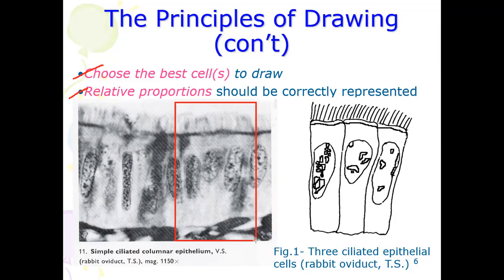Now, in the nucleus, you can see nucleolus as well as the heterochromatin. So therefore, you need to draw them. You actually need to draw them because you've learned those structures. So can you see that inside the nucleus is not empty? There's something there, but there's no shading because you cannot shade. Cannot shade means you cannot put the dot also because you use dot for shading purpose. You can see a dot here, but you cannot dot there. You can only outline an object that's big enough for you to outline, like this one here.